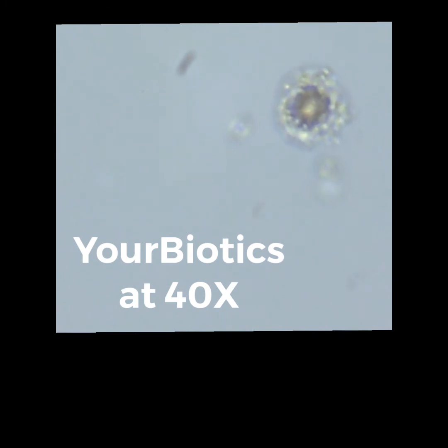At the top right, the middle is like the center of the universe in the microbial world. It's a plant cell and you can see it glowing, and around it are many, many life forms. You can see them wiggling and moving around. They're also glowing in gold, which means they're full of energy.